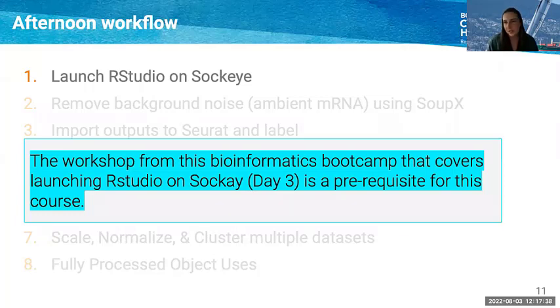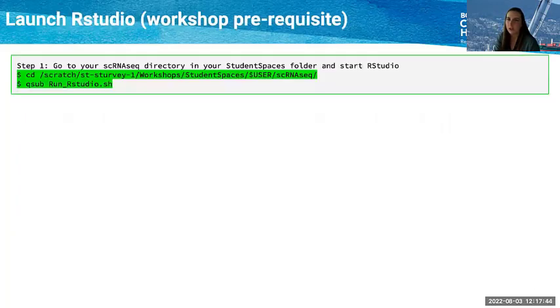Knowing how to do this as well is technically a prerequisite for this workshop, but since we do have the time today, we're going to make sure everyone gets this up and running, because this is how you're going to be able to see everything.